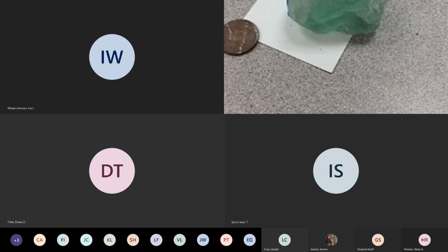But for now, where you wrote these things down, you can just hold on to that. You do not need to turn that in to me because that is not for a grade. What we're going to do next week is identify these things, and you'll hold on to that paper as well. You'll want to identify them and then write down the important things for each one. Yes, if asked, I will be clear on what color you are looking at. You might have to remind me a few times.